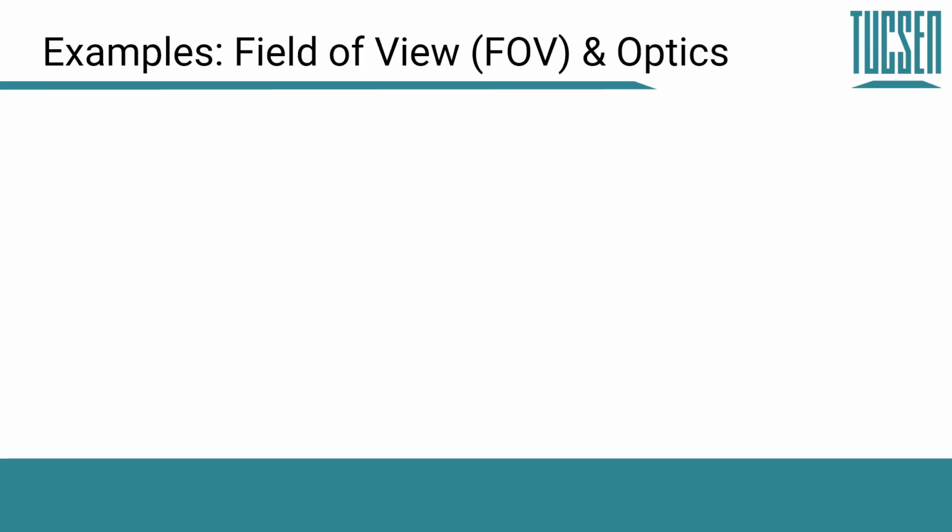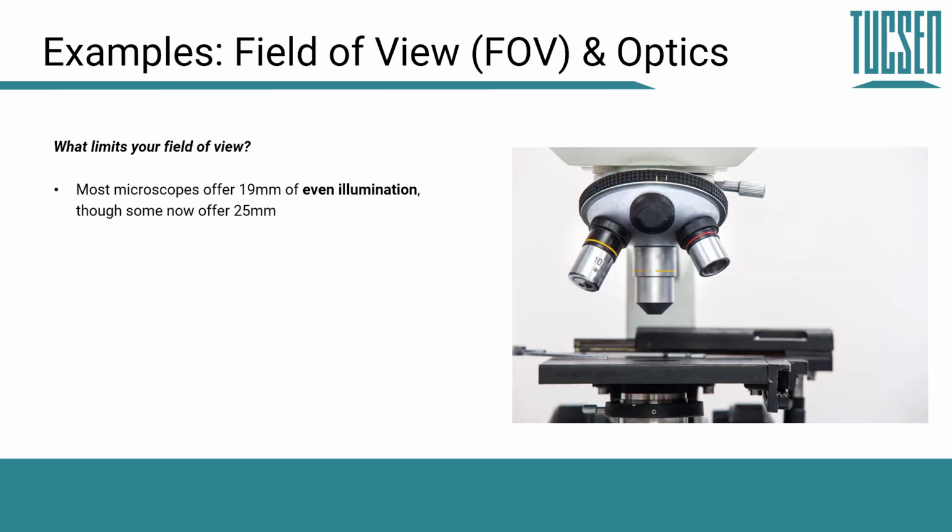Next, we have examples for field of view and optics. And the question is, what limits your field of view? If you're using a microscope, most microscopes offer around 19 millimeters of even illumination and 19 millimeters of flat focus.